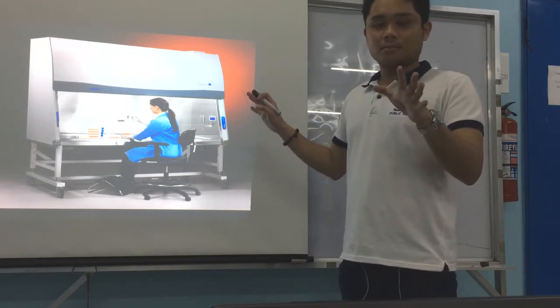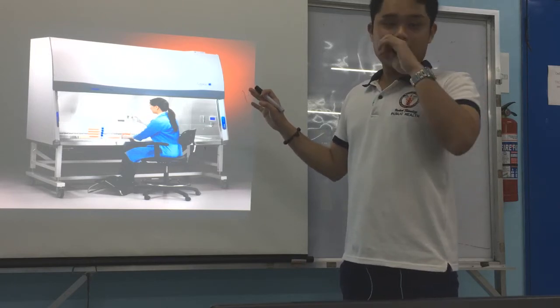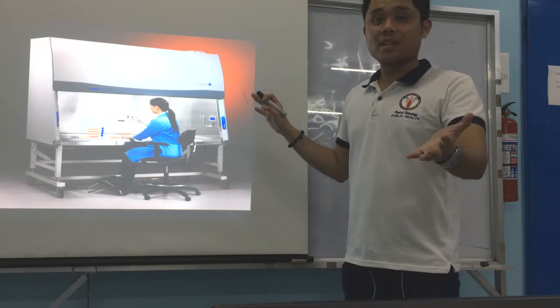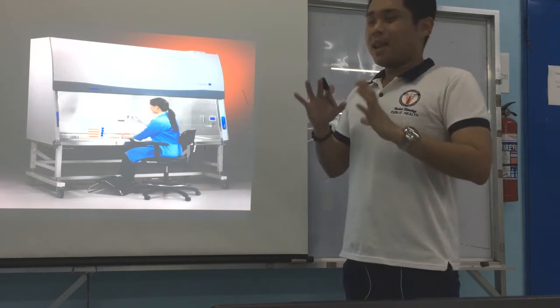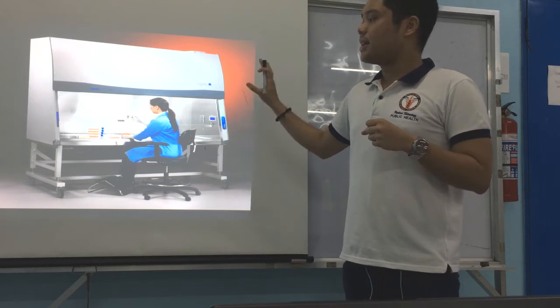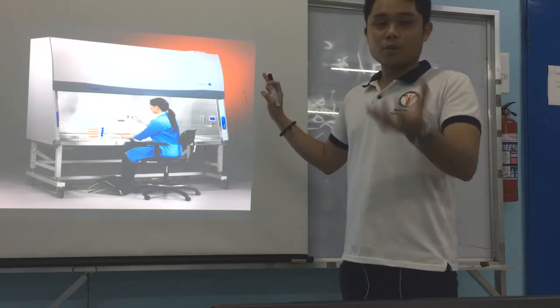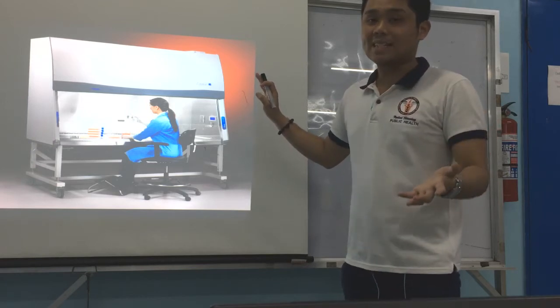Now, again, you have already had a previous lecture, the one I lectured on laboratory safety, that's general. And this is just an additional, based on Mahon, which is your main reference textbook, and also some information from Bailey and Scott's.